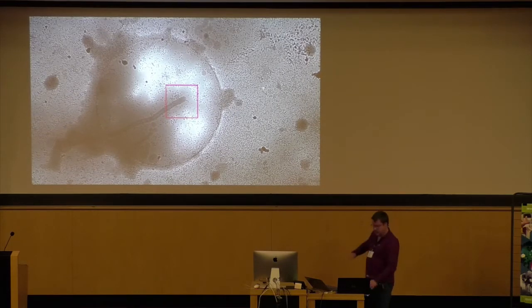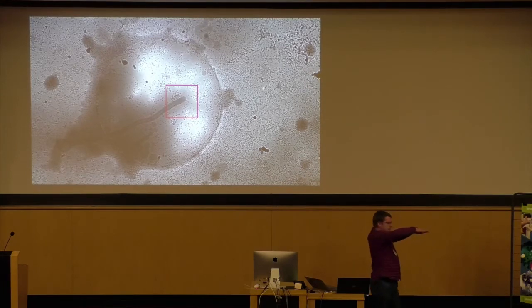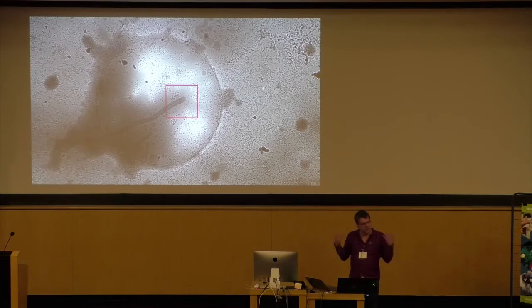And what you then get is, as you kind of want to connect these two branches, it's not just this shift, there's going to be an X tilt. With fiducials you can kind of solve for it, but somehow all the tomograms that had this effect, you could align and align and align, the residuals were just so high that in the end you just had to throw them out. It's kind of like the bad lamella, you see this, throw it out.